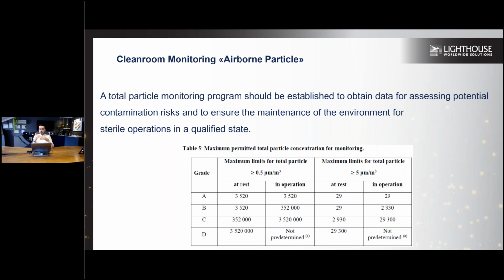During production, you can turn it off, or you can set this sampling point location a little bit higher than the needles, so that the dust is not coming, but you are still providing clean supply air. And finally, after production, you will turn it on again or put it into the filling point nearby the filling height, so that you will be proving that before and after conditions are within the grade A conditions.